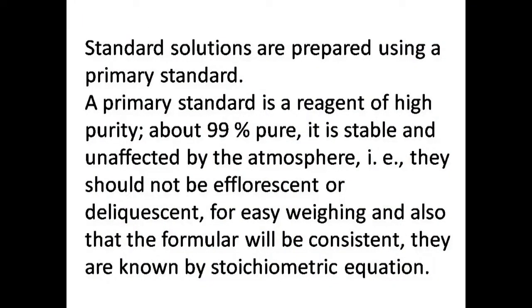Primary standards are reagents that have high percentage purity of, say, 99%. They are stable. That is, when exposed to the atmosphere, they remain stable. They are soluble. They are known by known stoichiometric equation. Now, standard solutions are used to determine the concentration of other substances whose concentrations are not known.